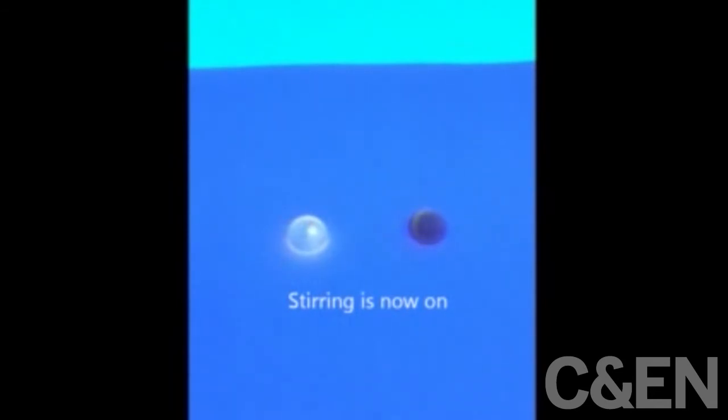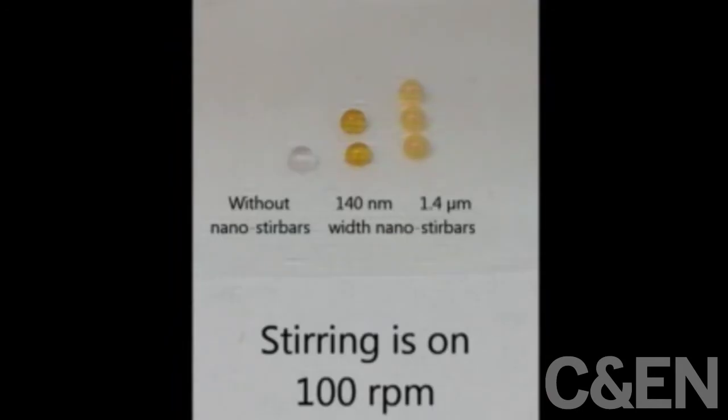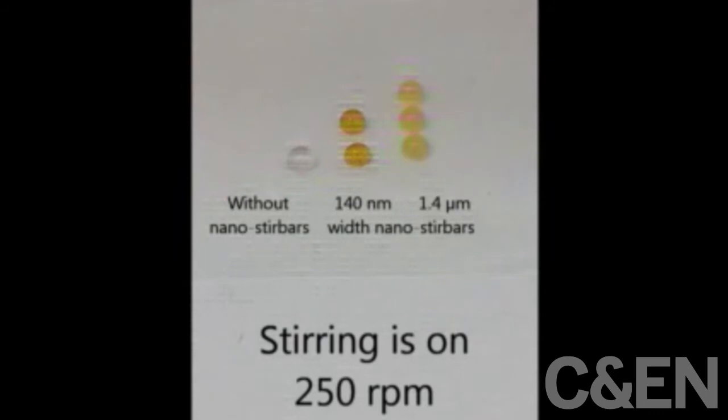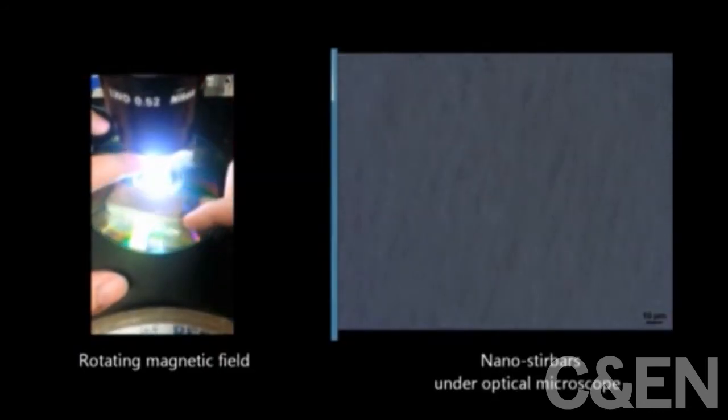You can also see how droplets containing nano stir bars blink in unison when sitting atop a rotating magnetic field, and how they align with the magnetic field when the magnet is rotated.